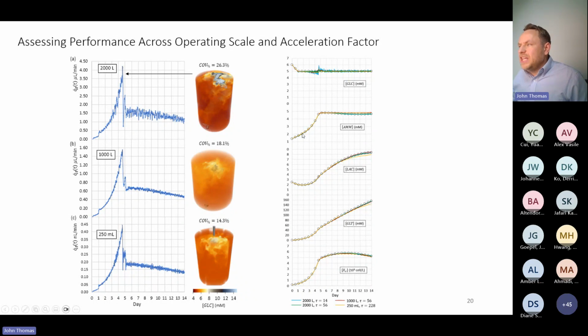These black points here represent the exact solutions with no time scaling. I'm modeling a 14-day process. These lines here represent the predictions from the solver at different scales with different time scales. So even with taus up to like 56, which means almost like a 12-hour process, even in those systems, the 12-hour process is still slow compared to the 20-second blend time that is close enough to infinity to represent the well-stirred non-scaled system.